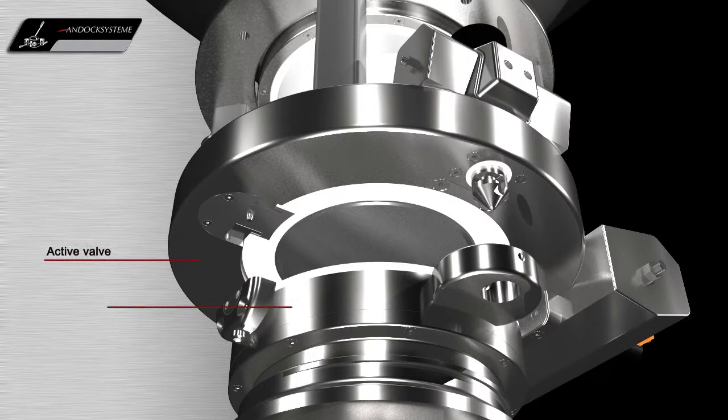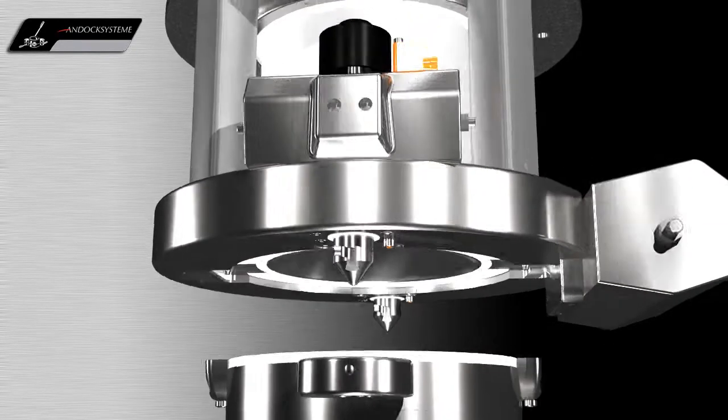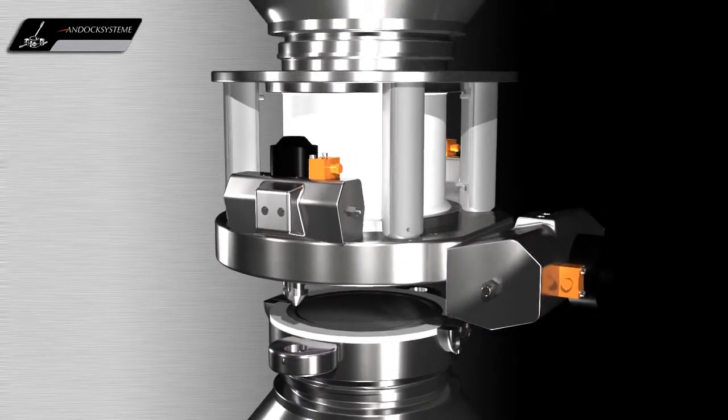The N-Dock docking system consists of an active and a passive valve, which are both equipped with a precision bearing shaft. The passive valve is usually assembled to the inlet and outlet of the mobile container. The corresponding active valve is fixed to the respective process unit. This allows the container to dock to the equipment and be charged or discharged in a fully contained manner.